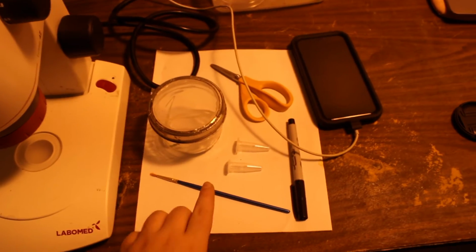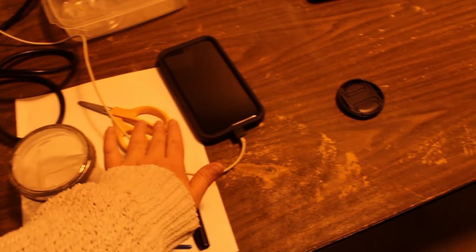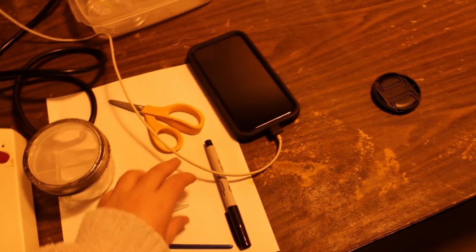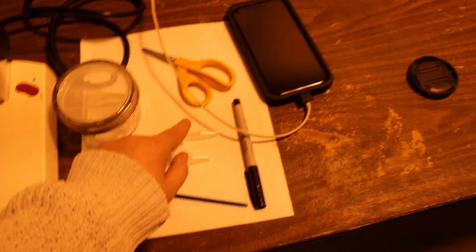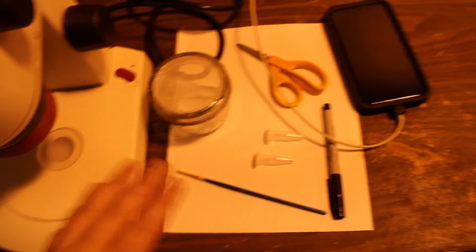The materials aren't too fancy. You need a paintbrush to safely get aphids, tubes to hold the wasps and aphids (don't mind the Sharpie, I didn't use it), scissors to trim your plant, and a container to hold the plant with the aphids. Make sure it doesn't let parasitoids get in. I ended up using 2 different colors of tubes just to differentiate which ones have been used and which ones haven't.